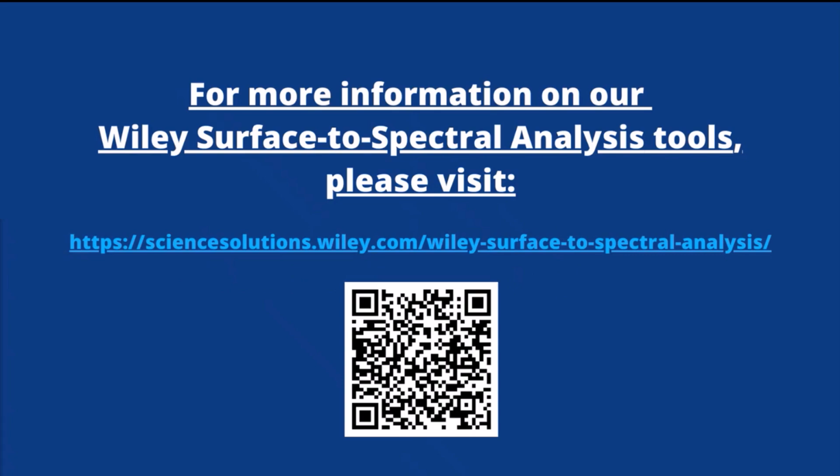All right, here's another one. Can you tell me more about some of the add-ons that are used? Certainly. Yeah, so there are a number of add-ons to the software to get access to additional features. There's an SPM add-on for scanning probe microscopy or force microscopy. So this would include atomic force microscopy and scanning tunneling microscopy. Another add-on is for particle analysis. This is a toolkit to analyze images containing particle shapes.